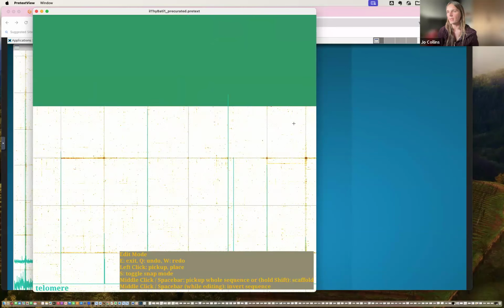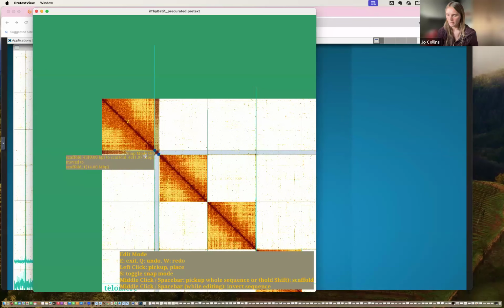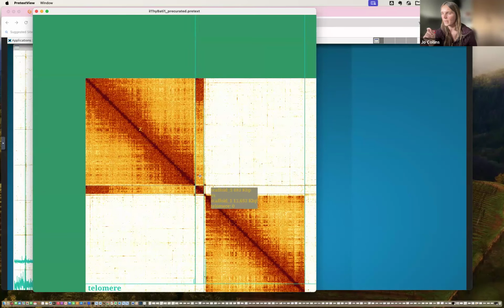And sure enough, we come over here and we find there's one piece of shrapnel that has really, really good, I can't think of the word, really good affinity, sorry, to the large scaffold. So what we can do is bring that over, and I'm going to make sure that I press my S now. So I'm pressing S and just putting it next to the scaffold that it belongs to, just so that we can talk about what we're looking at here.